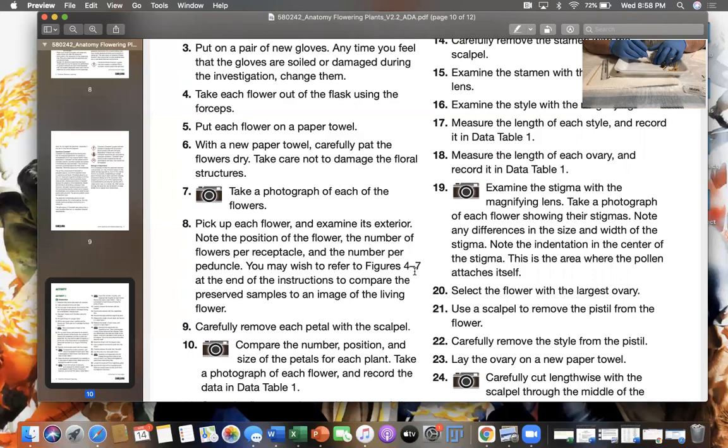Yeah, okay. Found the ovary of the daylily. How you would know to do that, I don't know. It's actually down past where the stamens form.